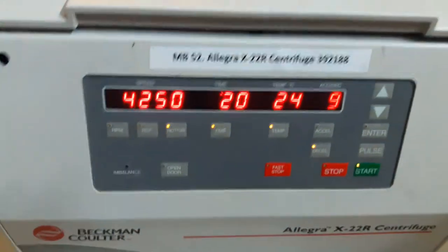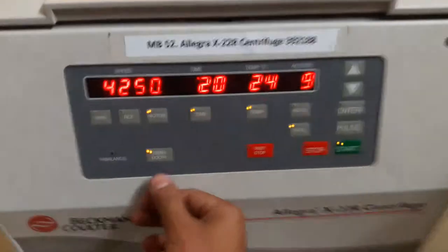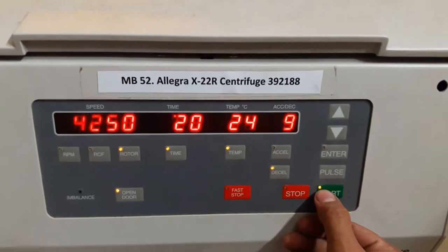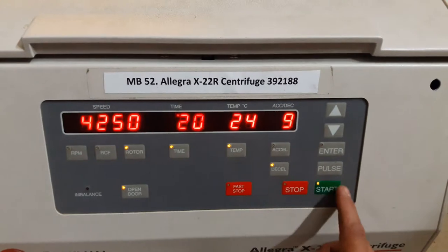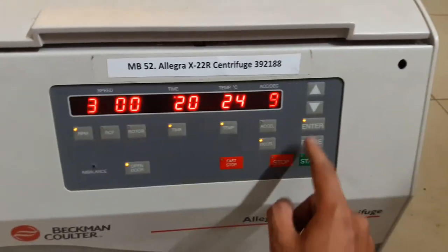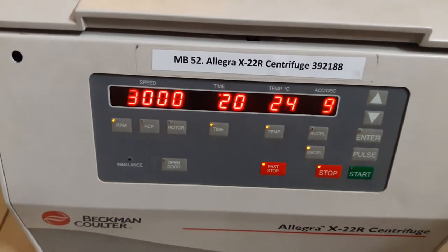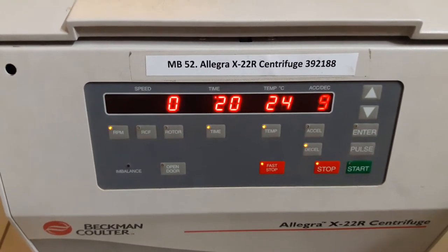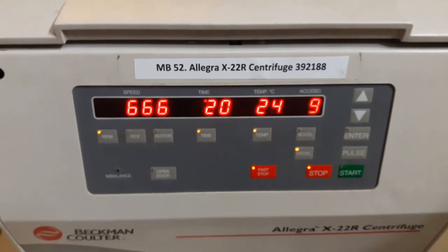I close the door properly. When I close the door properly, this light starts to glow. Then I press enter, and now I'm starting it by pressing the start button. It's working.